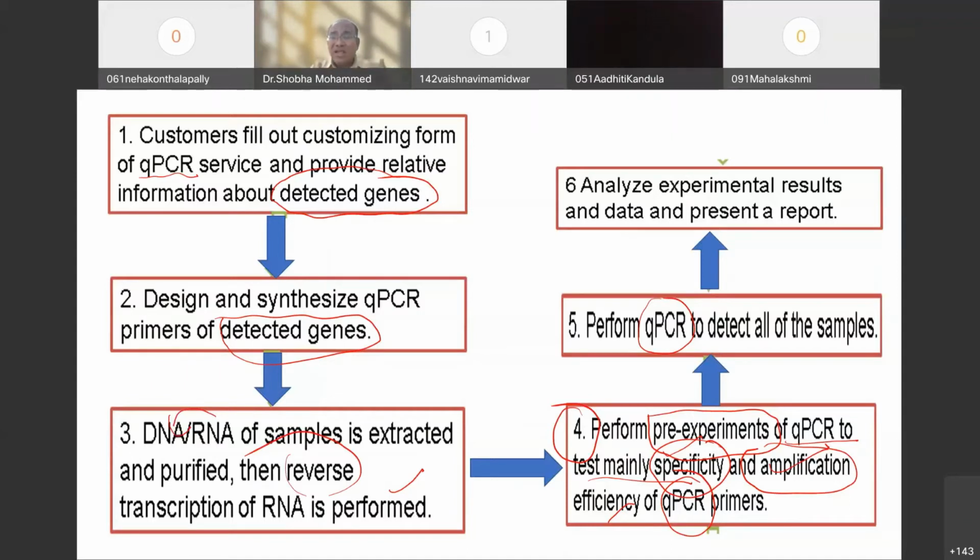So what I want, definitely, is to detect the genes which the customer tells me they are looking for, that specific gene. Recently, we were doing one work on the uterus in collaboration with Kamineni Life Sciences. Fibroids and cysts develop on the uterus, so we extracted them and wanted to know which gene is causing this.